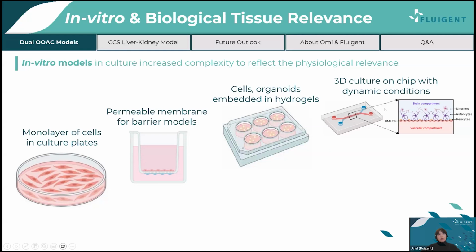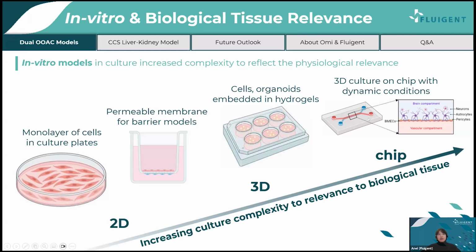As we move from 2D to 3D to microfluidic systems, we increase dimensionality and physiological relevance, which allows us to have more predictive responses.